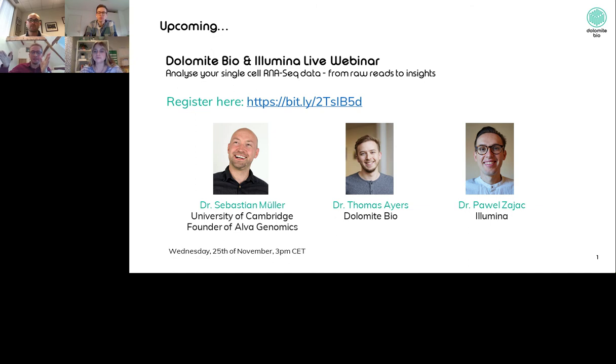But basically what that is, it's taking the internal computer brain from the Nadia and the pumps and using them instead of having to have a whole new system, basically. That's why it's an add-on. And what that means as an extension is that any protocol that can be developed on the Innovate can always be ported back onto the Nadia to be run in full throughput. So whilst you can play around with one sample at a time, once you're done with playing around, that can go back into 8-sample mode, 4-sample mode.